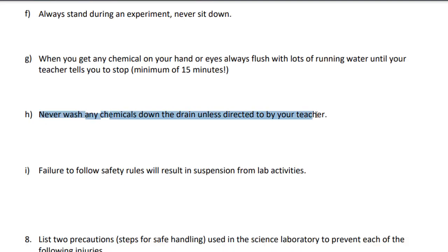Never wash anything down the drain unless I tell you to do so. Why do you think that's an important rule to follow? That water gets recycled in our community, right? It gets filtered and it gets put back in. So we want to make sure that we're not adding any chemicals to the city water that could then cause somebody else to be sick later on. So we've got to dispose of things properly.